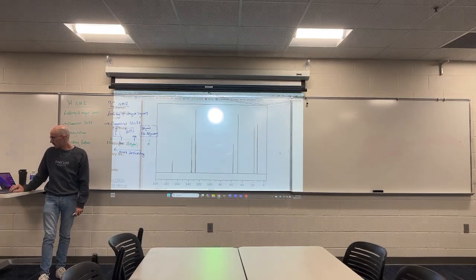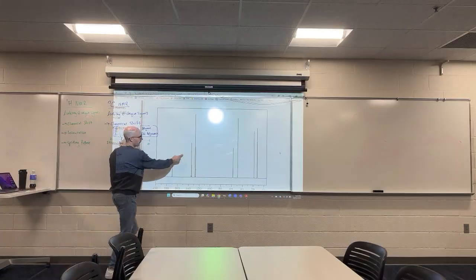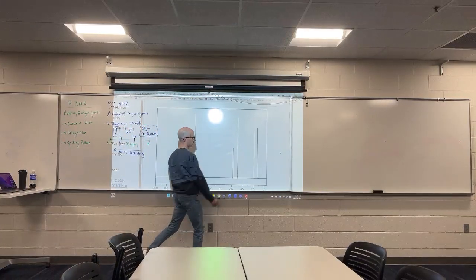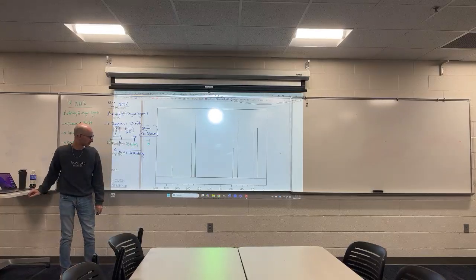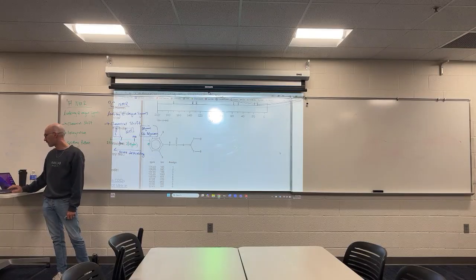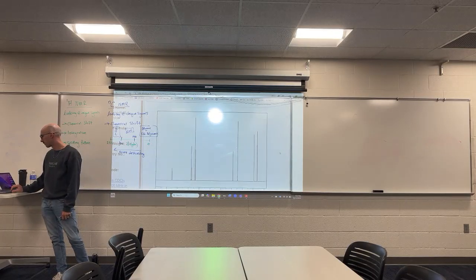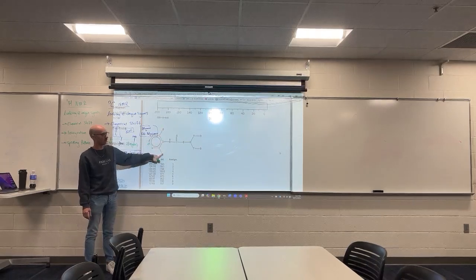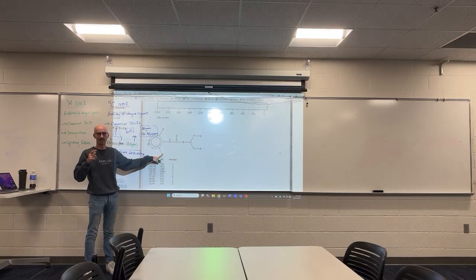So 1, 2, 3, 4, 5, 6, 7, 8. Where's that 9 coming from? Good question. Well, it says, I'm misunderstanding the structure of lidocaine. I'm sorry. This is a methyl group that they've labeled as carbon number 8. Yeah, a CH3, a CH3.